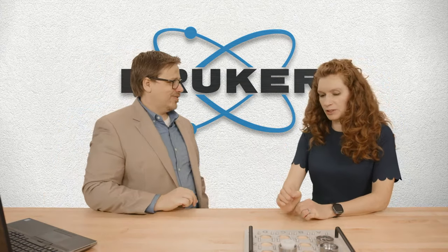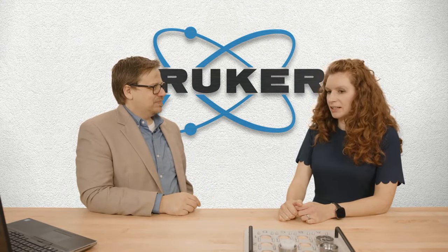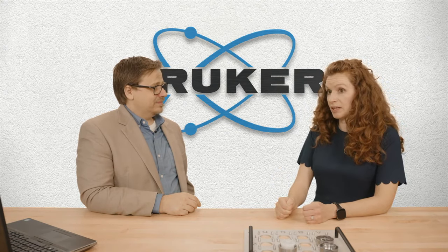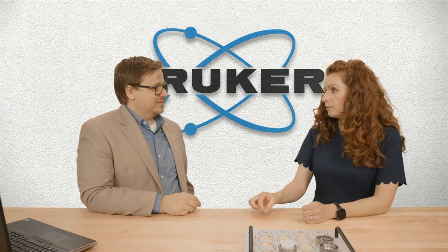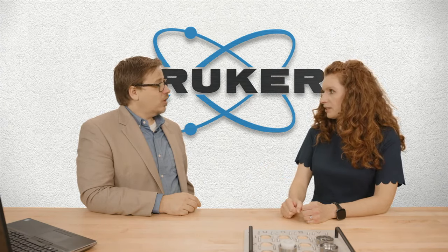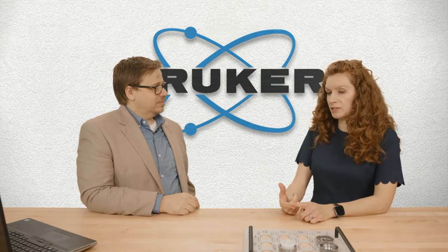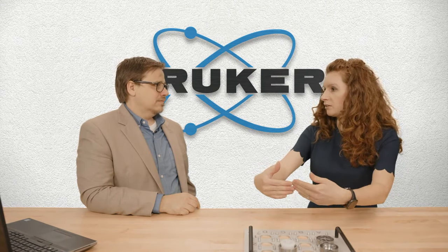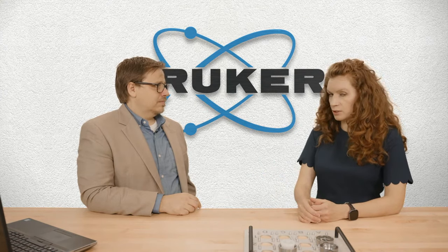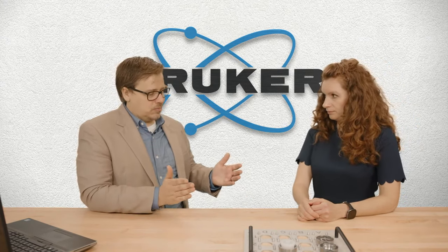Let me elaborate on that, or add one more thing, just to get an idea: the decimal points that you can definitely expect is usually two, is where we are. That's also where C114 comes in. And if you have great standards, XRF is very good at what goes in comes out. So if your standards have a precision of three decimals, that's what you can expect from your results as well. And so much of this also depends on the person doing the experiment.